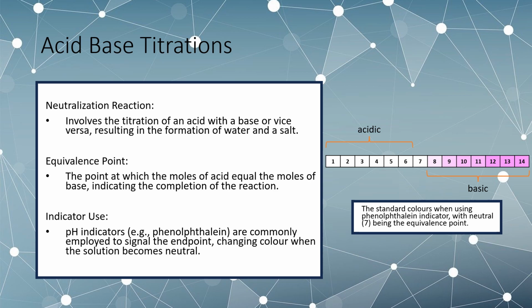The most common titration indicator is phenolphthalein and used very often in early labs into titrations, which goes a light pinkish to darkish pink as you become more basic, as you can see on the scale on the right. So when performing an acid-base titration using phenolphthalein, you want that really light pink to move back to the clear. As you can see, 7, which is our neutral on our pH scale, is still clear. So we want it to be just before that point of light pink to indicate a full reaction between our acid and a base.